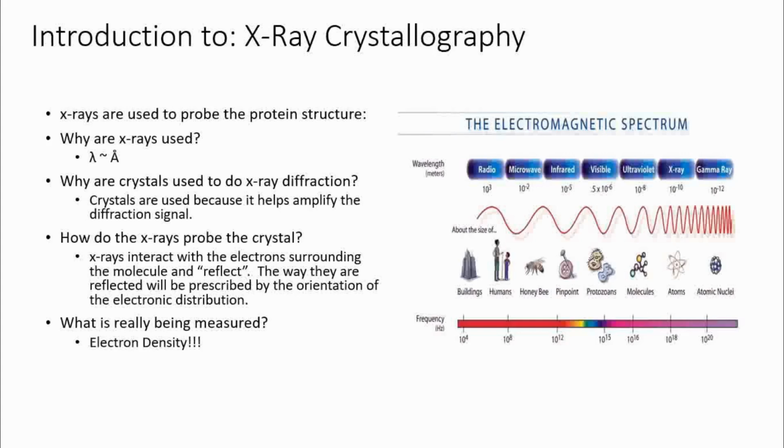Now why am I saying intensity of x-ray? Because when the x-ray goes and hits a particular atom or molecule, it actually goes into its electronic environment. So the electrons rotating there, the x-ray goes and hits there, and depending on the density of this electron cloud over this particular atom, the angle of diffraction or the intensity of diffraction will be determined.